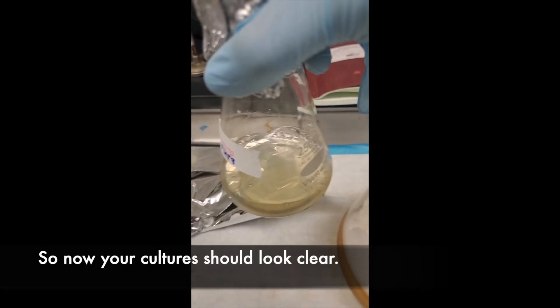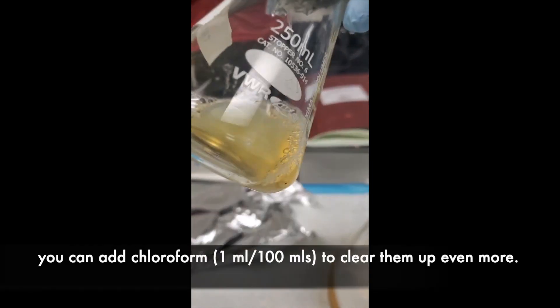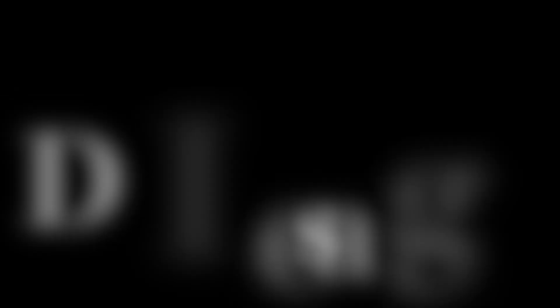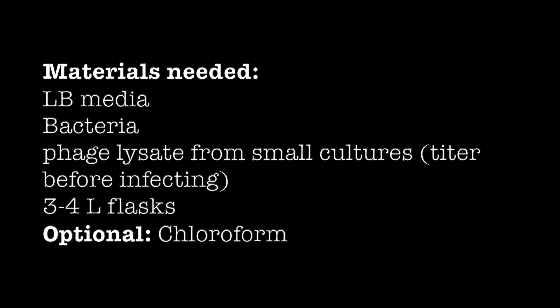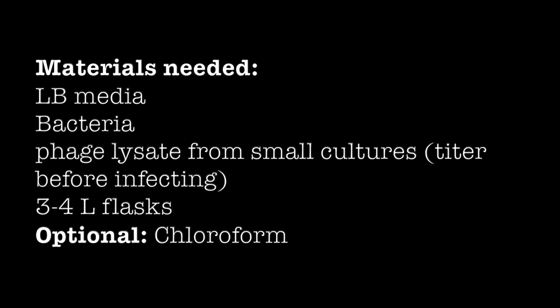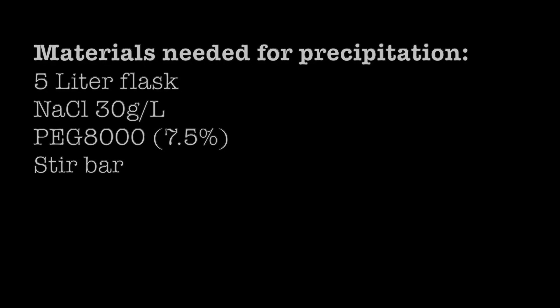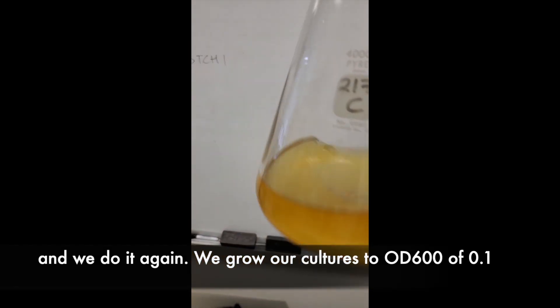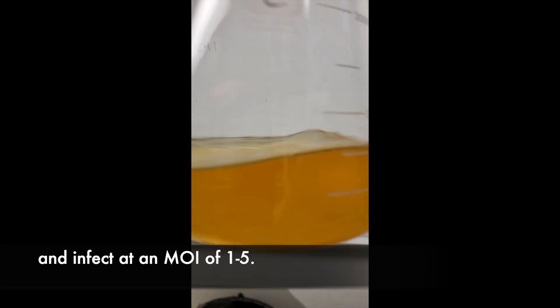Now your cultures should look clear, probably more clear than when you first started them. You could add chloroform and clear them up even more. Then we do it again — we grow our cultures to an OD600 of 0.1 and infect at an MOI of 1 to 5.